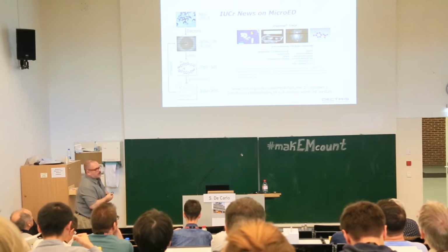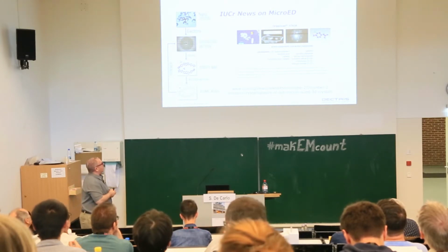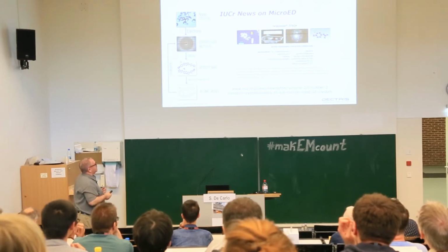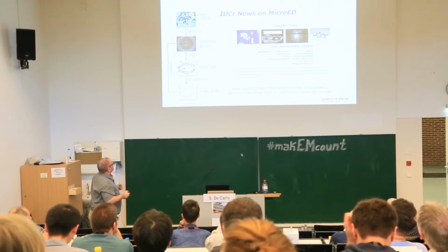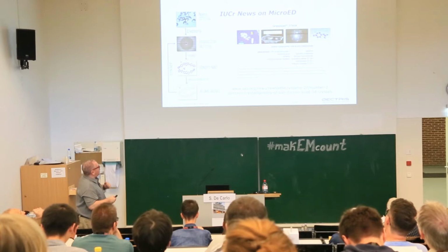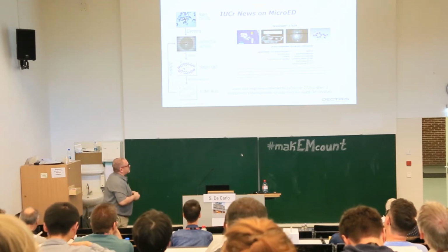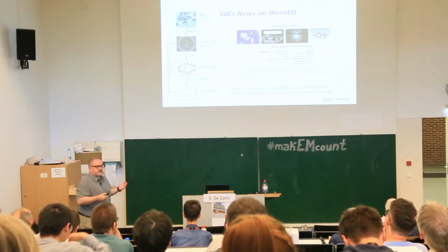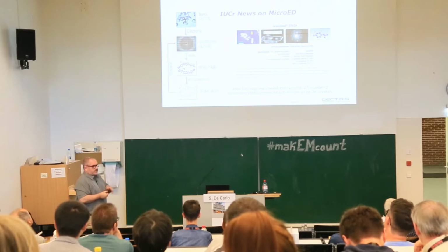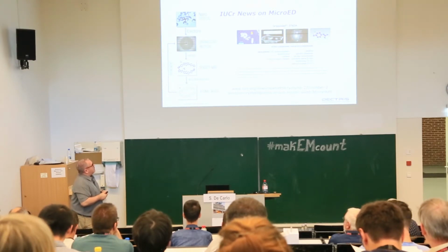Together with Tim Grüne and Julian Wenmacher, who is here in the audience, we also collected data, not precessing the beam this time, but by tilting the specimen and leaving the beam impinging onto the sample. They collected interesting data for micro-ED with our detector. Micro-ED is a technique that is in itself not new, so people have been using the ability to tilt the specimen stage of the microscope to collect data in diffraction.